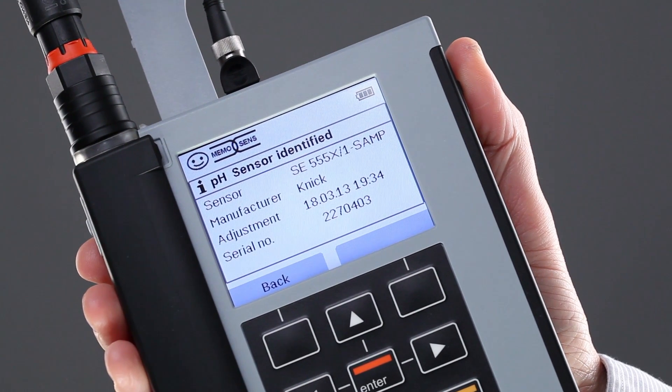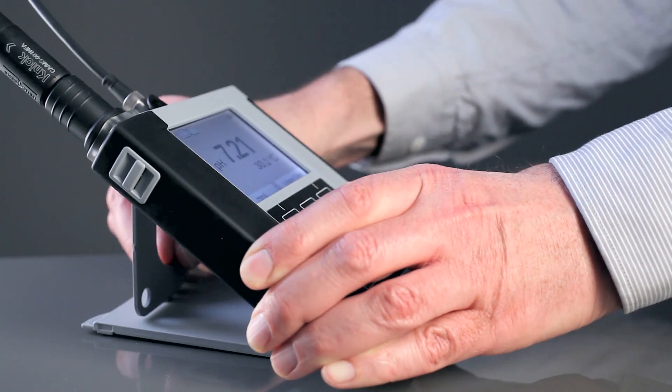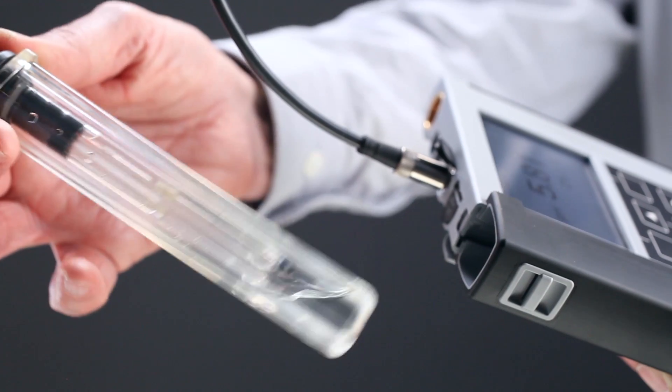Portavo automatically recognizes the sensor. Easy positioning. Protects the sensor from drying out.